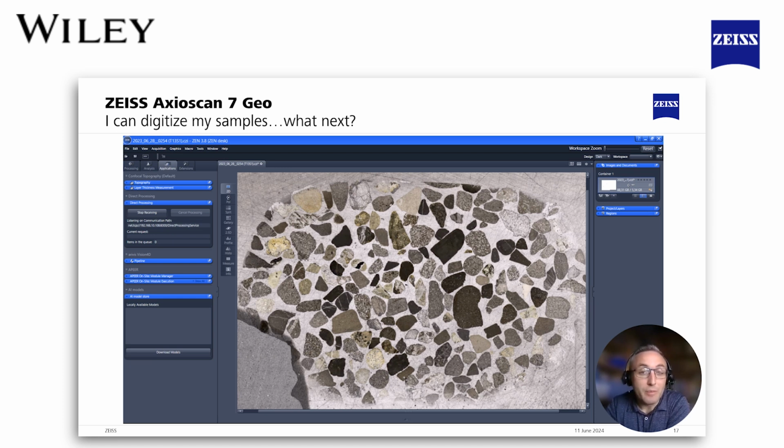It's a relatively simple task, which if you want to use something like point counting across this sample, you'll be able to get the answers very easily once you're trained on these rock types and to do what is essentially lithology classification rather than mineralogy, but incredibly hard to automate based on that traditional semantic segmentation.